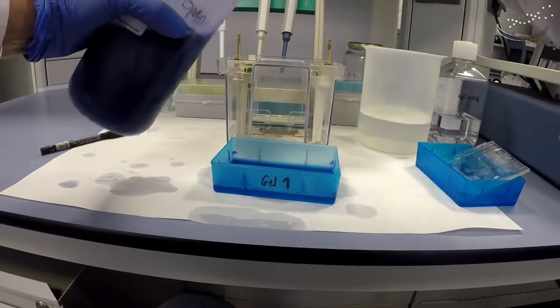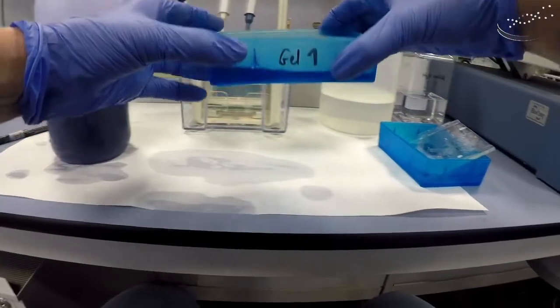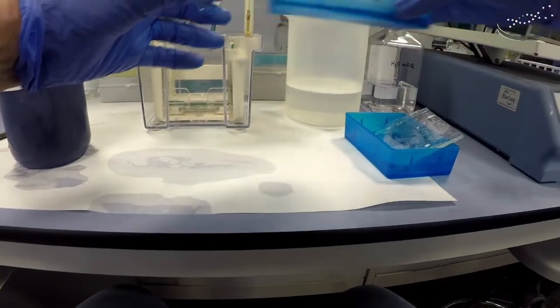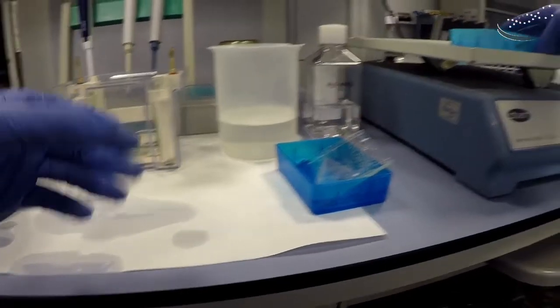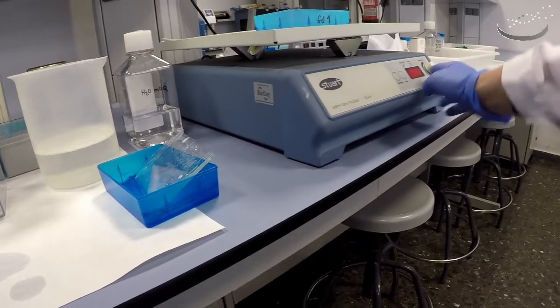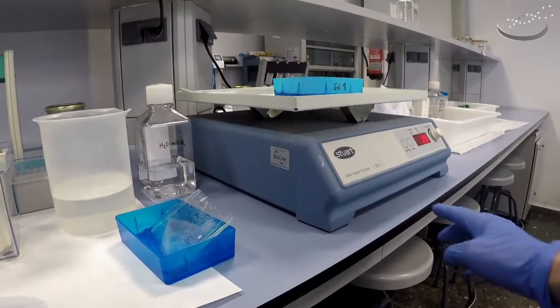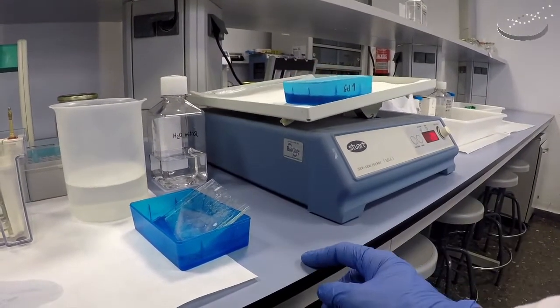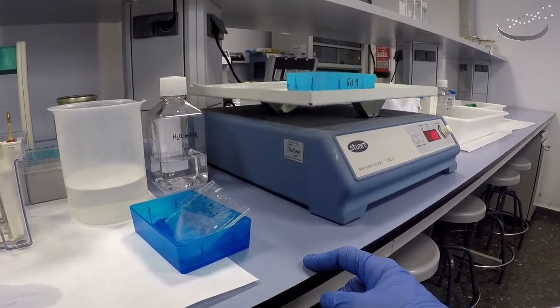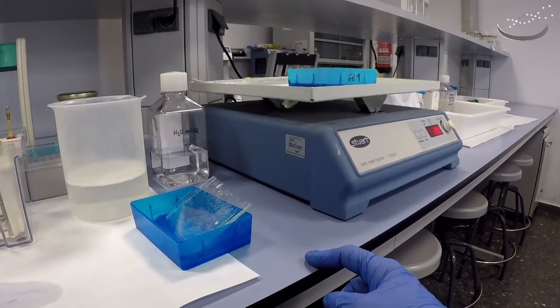We put in enough solution to cover the gel, make sure it's covered, and then place it onto a rocker. We will incubate that for 15 to 20 minutes. Just make sure the rocker is not going too fast — you just want it to gently move and ensure the stain is in contact with the whole gel.